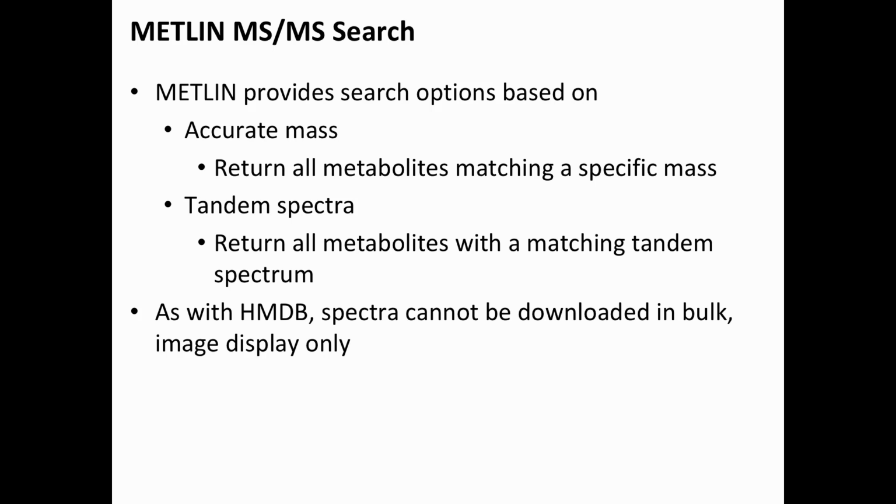It's going to give you some information. It's not going to give you the full information. The same way that we do not always see all the B ions, not all the Y ions. We see only certain fragments that arise from the structure. With typical MS-MS searches, we can still make use of that, because they will fragment in a consistent way.